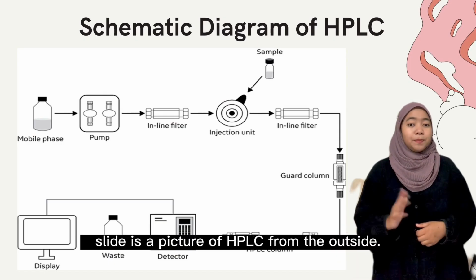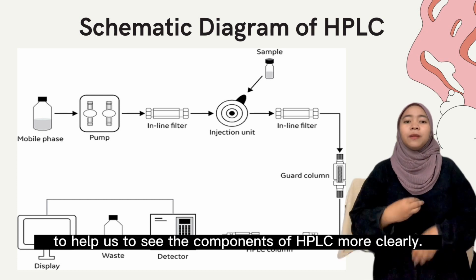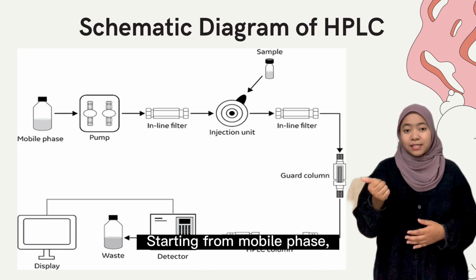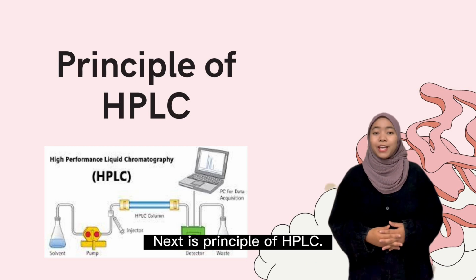The previous slide is a picture of HPLC from the outside. However, in this slide, it is shown the schematic diagram of HPLC to help us to see the components of HPLC more clearly, starting from mobile phase, pump, injector, column, and lastly detector. Next is principle of HPLC.